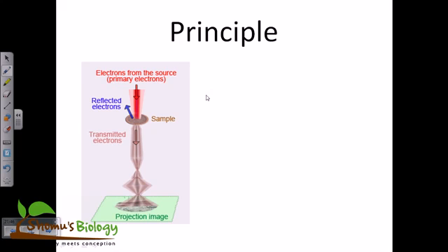So if you look at this principle, the idea always remains the same. That is, the electron is our first source. We need to drive that electron very fast. Remember, the structure of the transmission electron microscope and the scanning microscope is kind of similar, because both of them should have a tunnel. Both of them should have a tunnel inside.